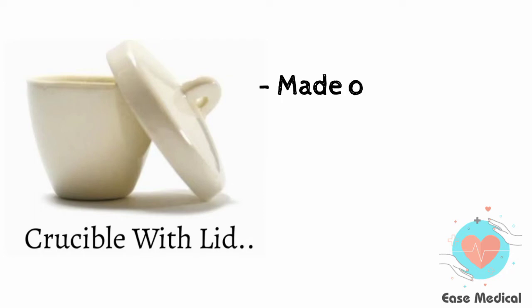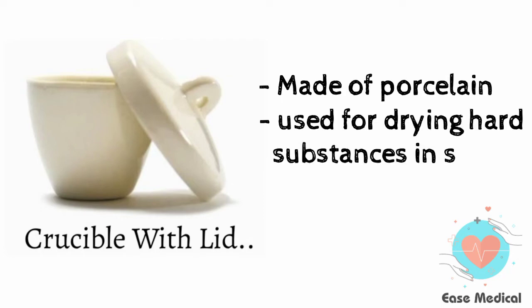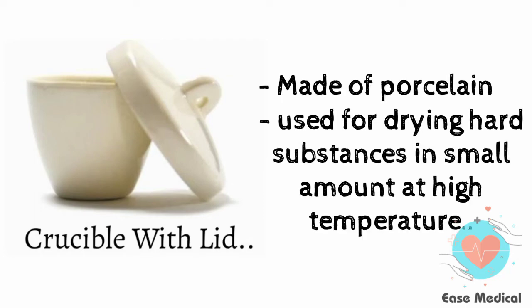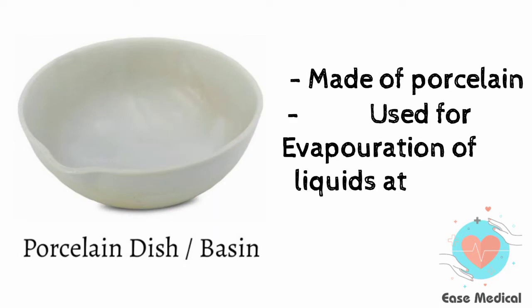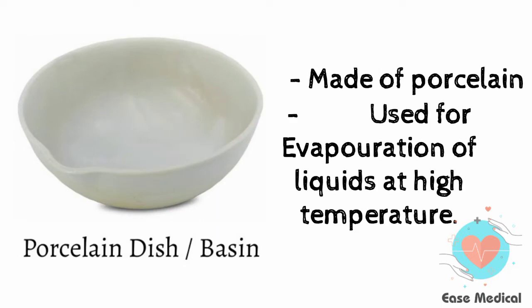In this video you will know about instruments used in homeopathic pharmacy. First, know about the crucible with lid, made up of porcelain, used for drying hard substances in small amounts at high temperature.